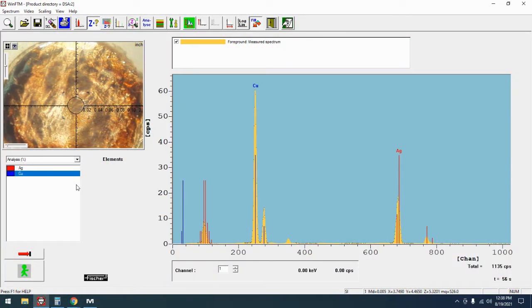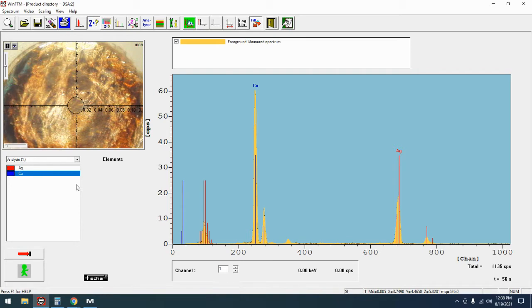Les from Delta and today we're going to talk about how to do a reference measurement on your Fisher X-ray. Now before we start talking about how to do a reference let's talk about why you want to do a reference.